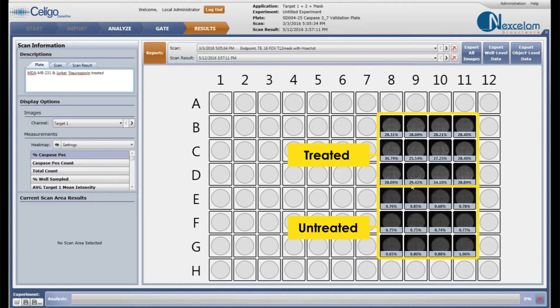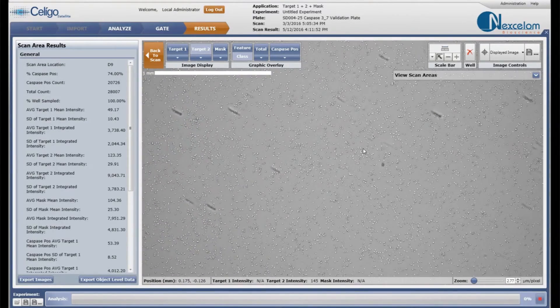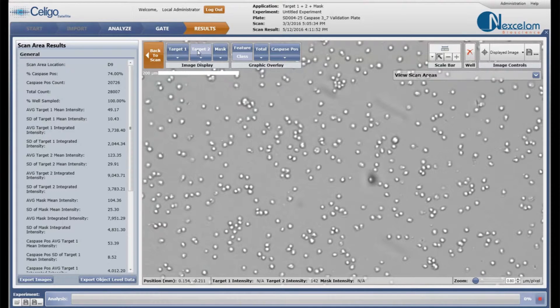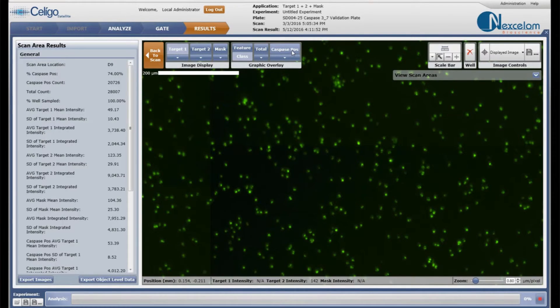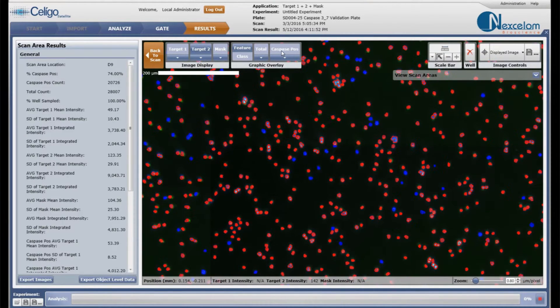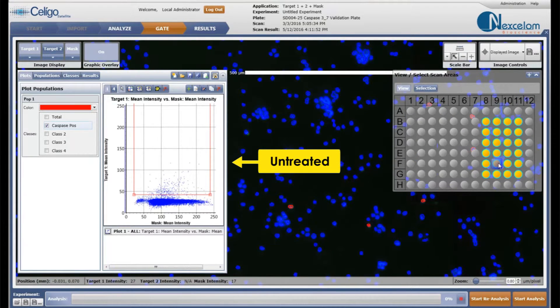Let's take a closer look at a treated sample in well D9. By double-clicking on a well, the whole-well image appears for review. We can zoom in to look at the cell morphology in the brightfield image and examine the staining and counting of caspase and Hoechst-positive cells. In this merged image, the blue outlines represent the Hoechst-positive total cells and the red outlines represent the caspase 3-7-positive cells. Celigo's built-in gating interface provides the necessary tools for plotting and analyzing 2D scatter plots, and optimized settings are automatically applied to the entire plate for easy data analysis.